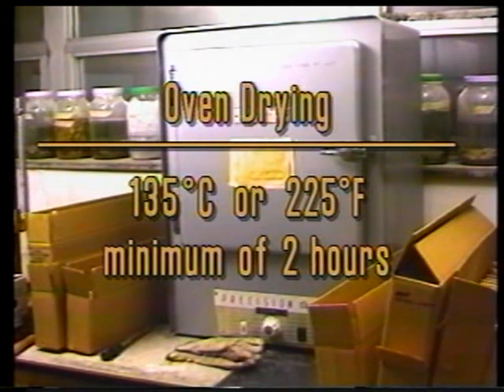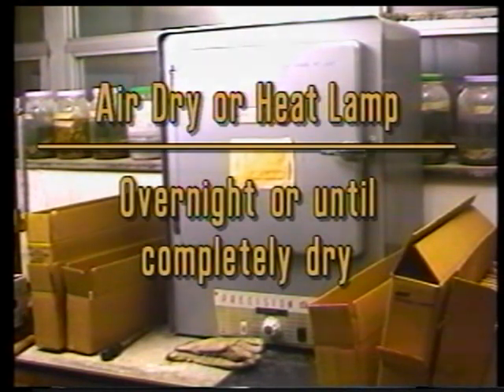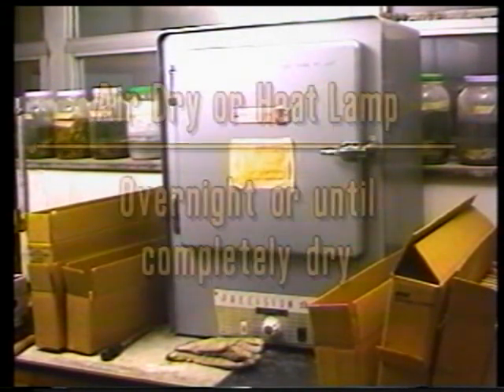If you don't have an oven available, you can also air dry the sample or dry it with the help of things like a heat lamp or a fan. The sample should be very dry before going on with the next step, and this will tend to be anywhere from a couple of hours if you're oven drying to overnight if you're drying it with a heat lamp, or maybe even longer if it's air dried.